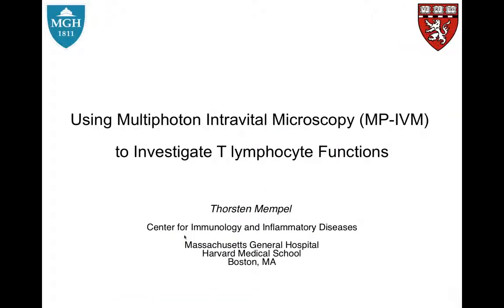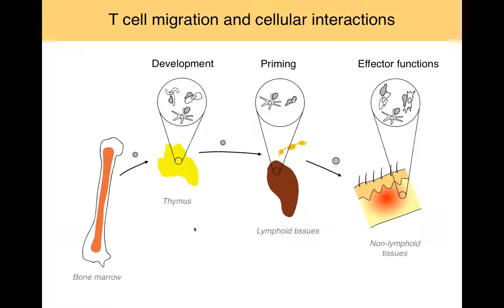So without further ado, I'd like to turn the presentation over to Torsten. Well, thank you very much, Jeff, and welcome everybody. So as Jeff mentioned, we use multiphoton intravital microscopy to study T lymphocytes functions primarily.